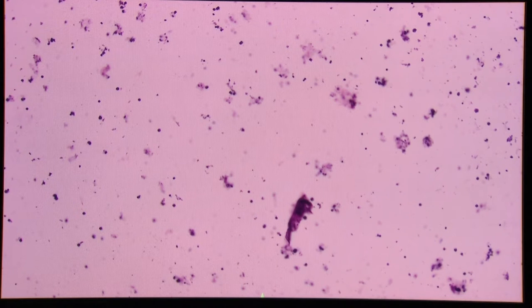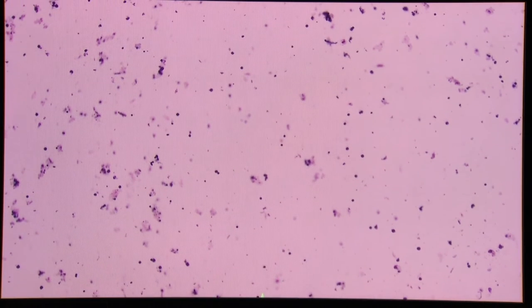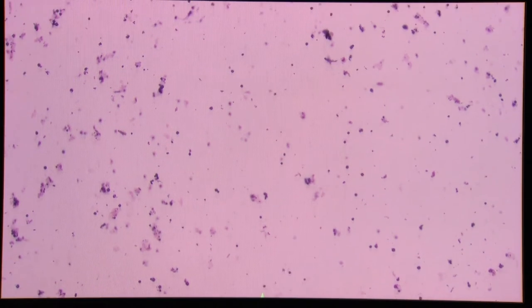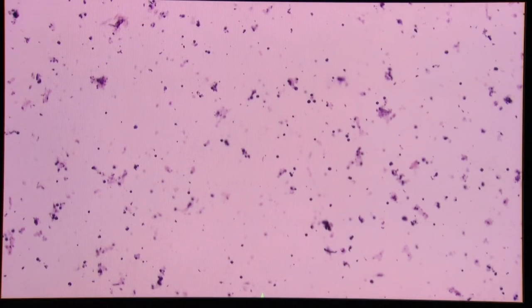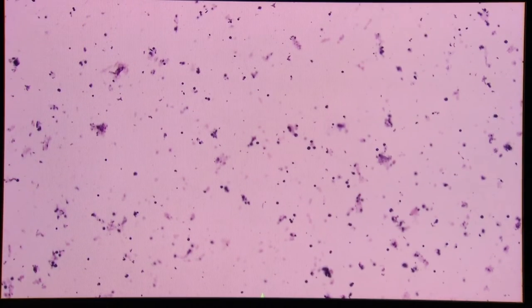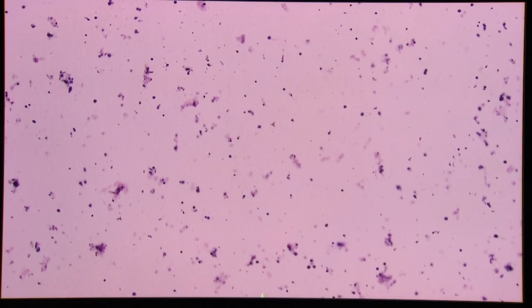We scan the slide under low power and look around the edges of the coverslip because that's where larger cells and casts will be pushed by the coverslip. We want to find the edge of the coverslip.